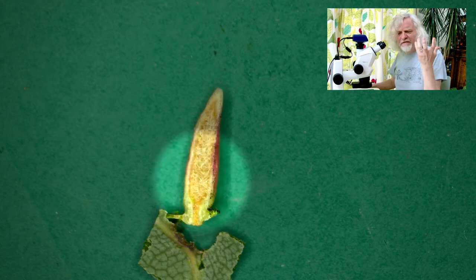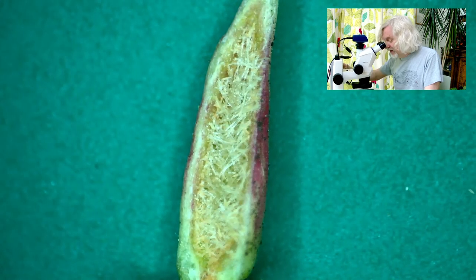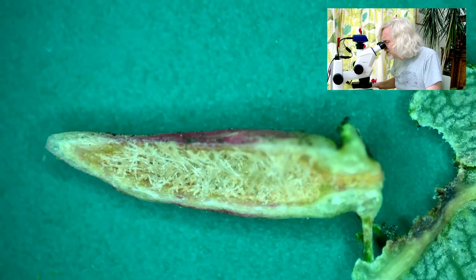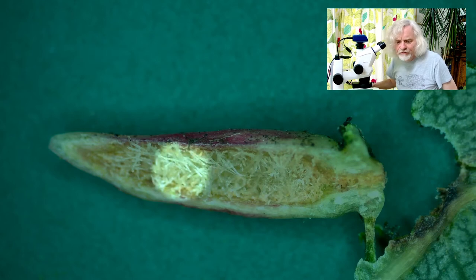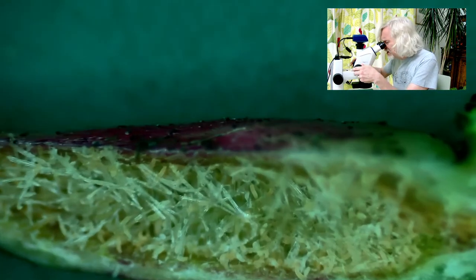There's definitely a sort of a pore, a sort of an entryway at the bottom, so I am indeed expecting some sort of critter inside here. I wonder if I turn this through 90 degrees. I'm going to have to actually turn the specimen rather than the camera through 90 degrees. If I do that, then we can sort of see it in a bit more detail. There's where it's attached to the leaf and there's a little pore at the bottom, and then it's full of this fibrous stuff. And if we zoom in even closer, hopefully we should be able to see the critters that are responsible for making this.